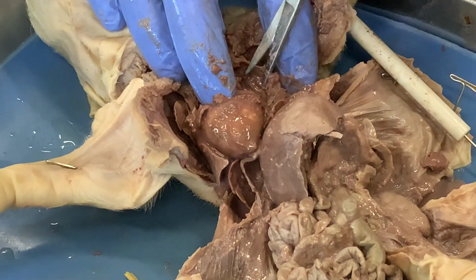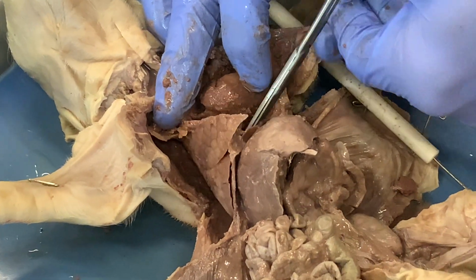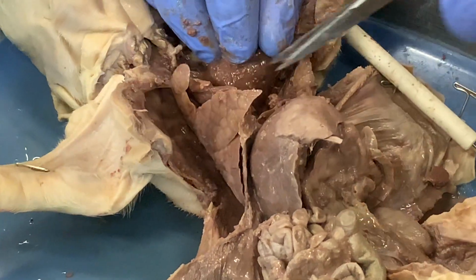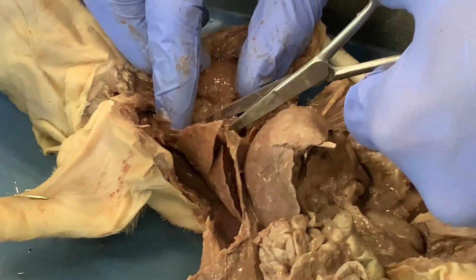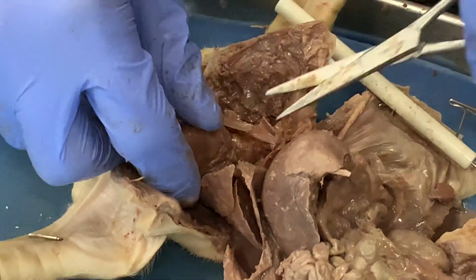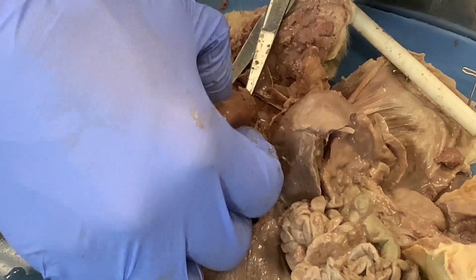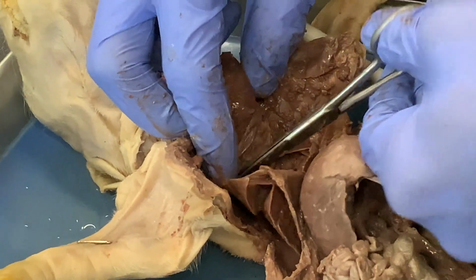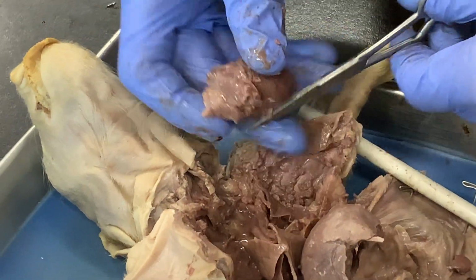So I'm going to do the same, where I'm going to remove the heart from the pericardium, trying to keep as many of the bases of the blood vessels connected to it as possible, so that we can demonstrate where blood enters and leaves the heart. A small piece of lung tissue there that we'll have to move off of it.